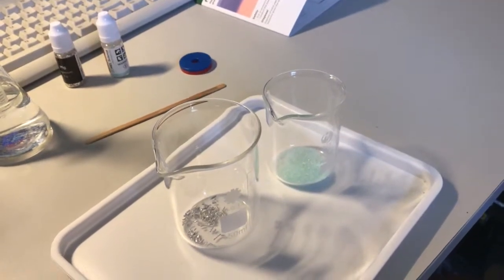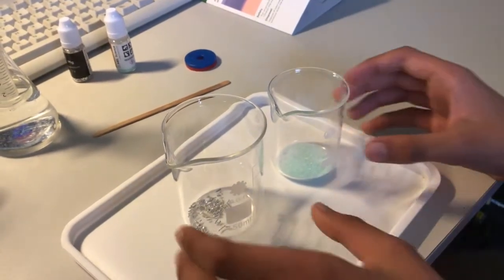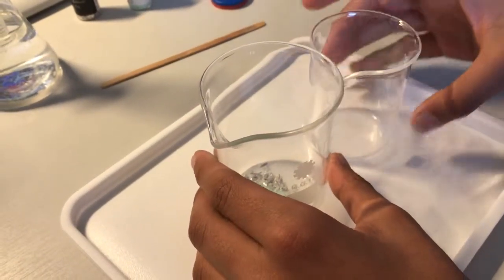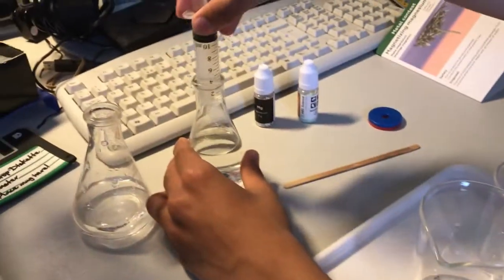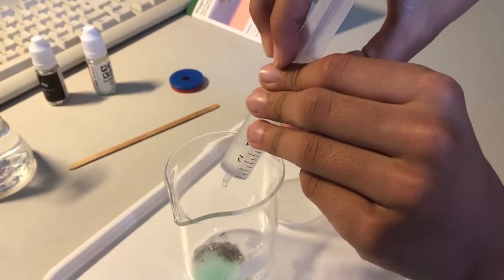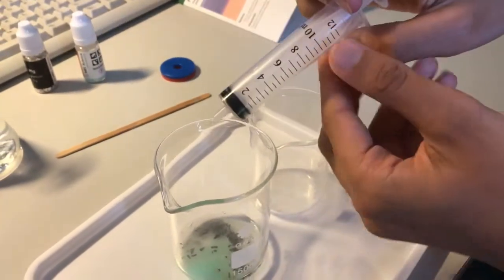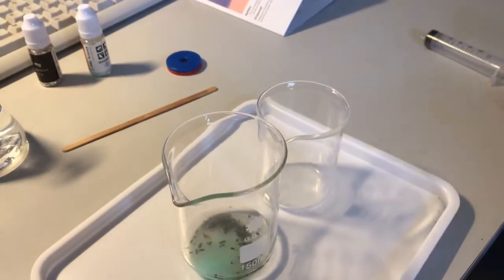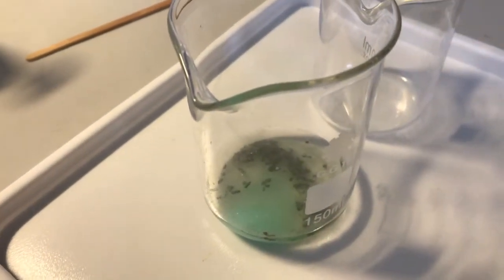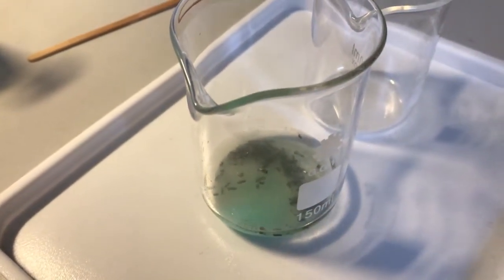We now pour the iron sulphates in the beaker of magnesium and add 10 milliliters of water to the mixture. Stir the solution for around 15 seconds and leave the mixture to stand for around 20 minutes to allow time for the chemical reaction to take place.